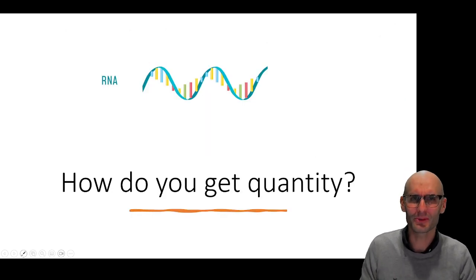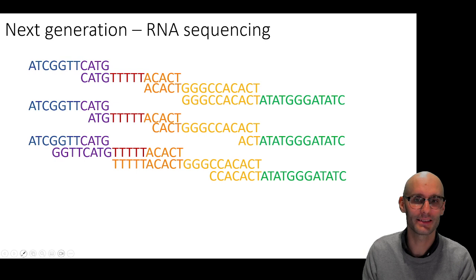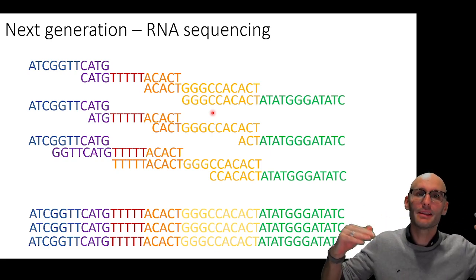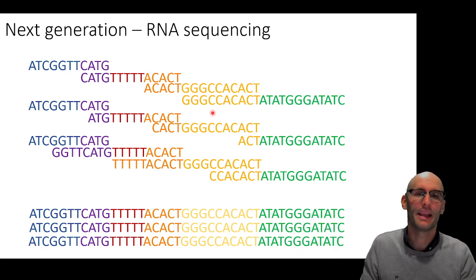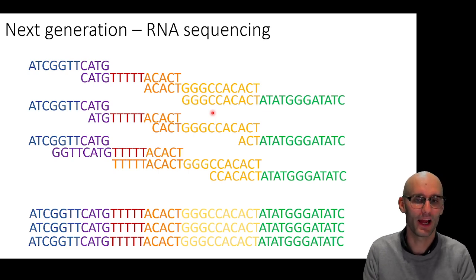So with RNA sequencing and with the DNA, how do we get quantity? Well, it just comes down to the number of whole transcripts that we can assemble. Here you can probably see that we've got different fragments all together, and it lines up to a certain number of RNA transcripts, maybe 4, maybe 3, maybe 5. So we just assemble the fragments together and we see how many fragments do we get, how long is the gene, how many fragments would we expect to get, and how many complete RNA assemblies do we get, basically. That's how we quantify in RNA sequencing.